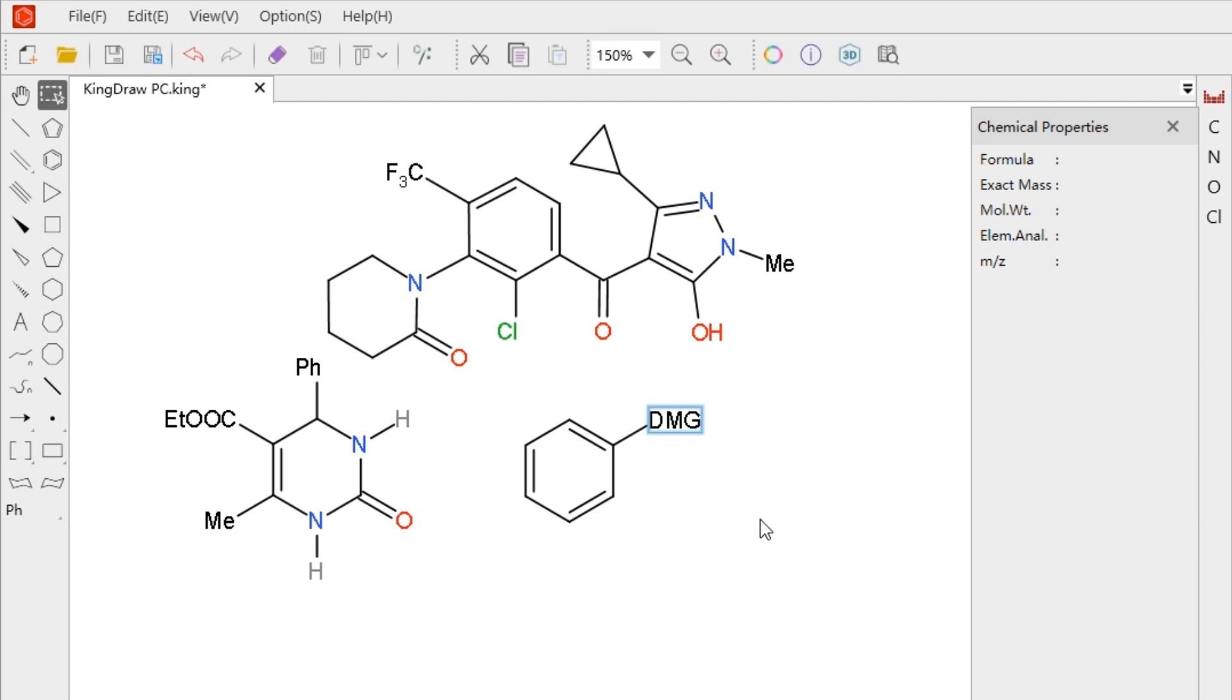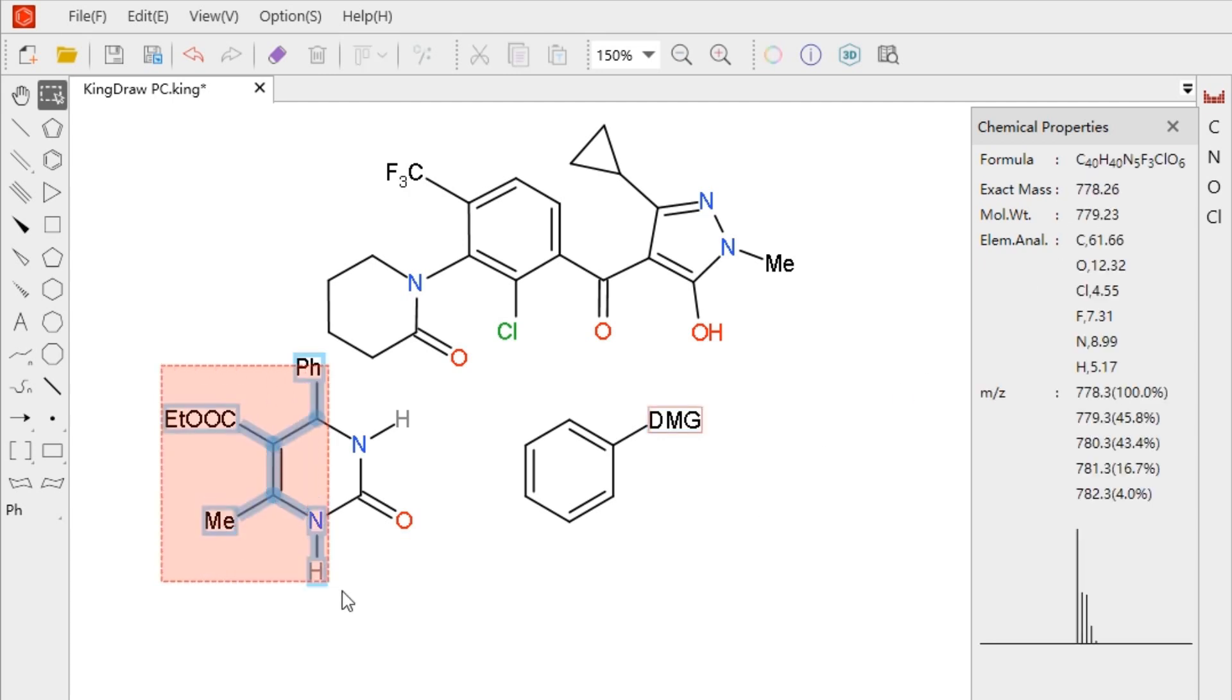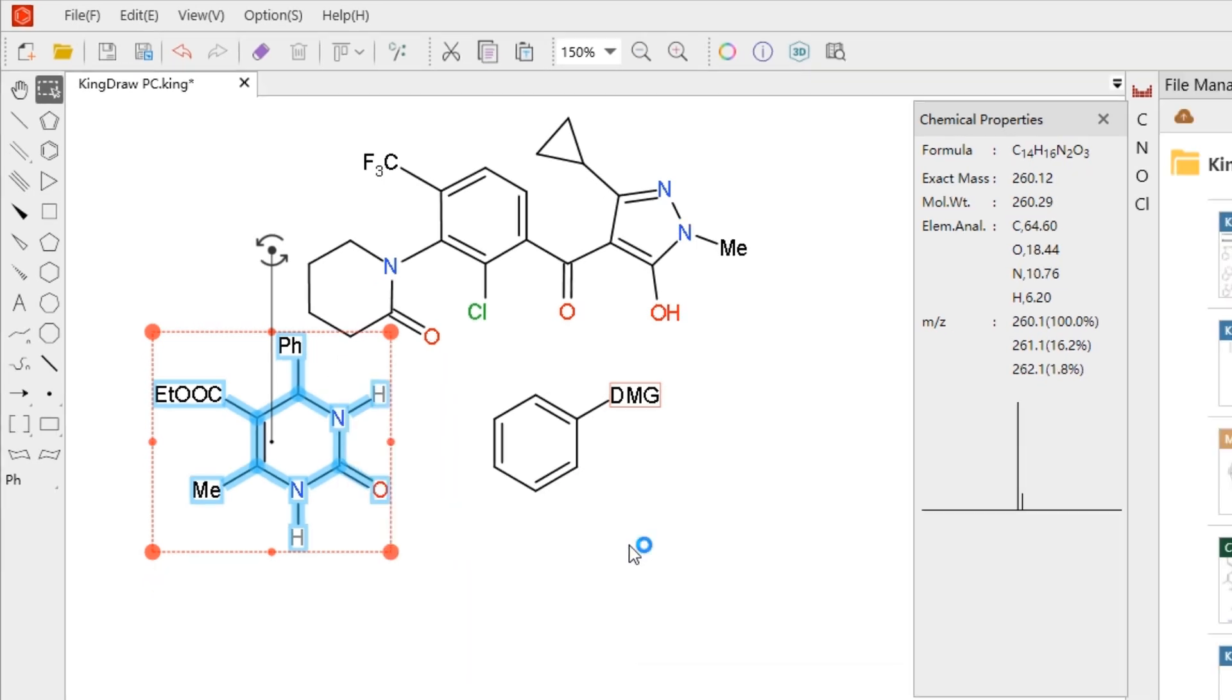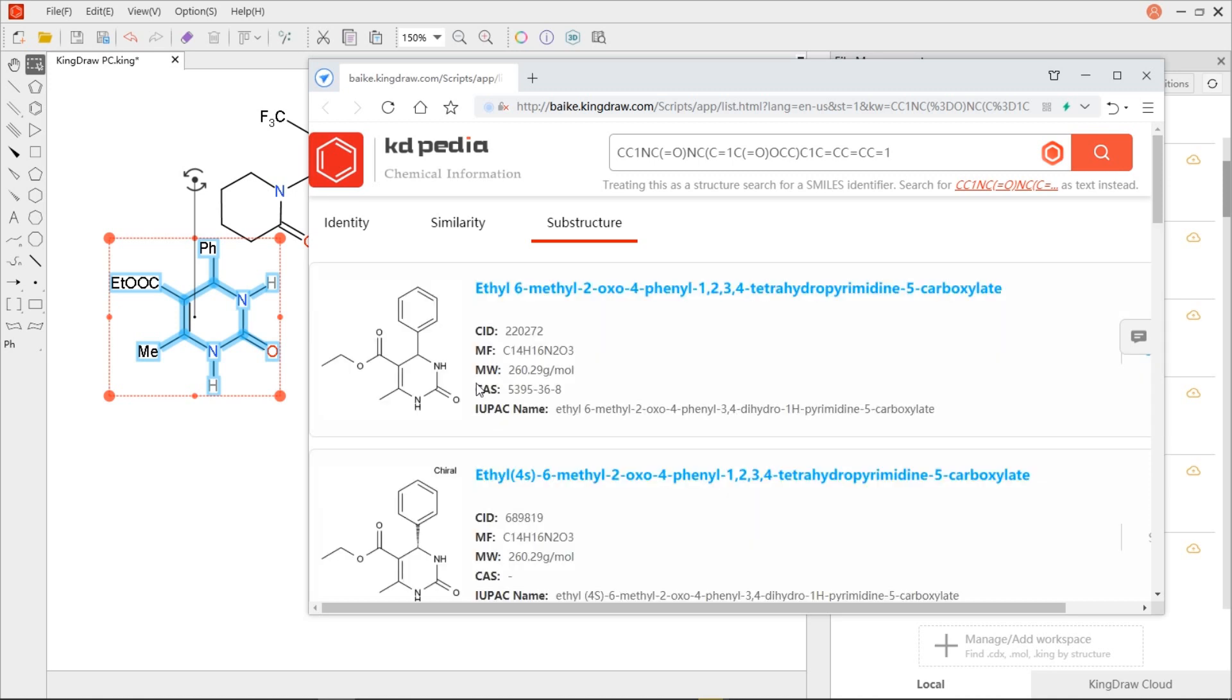If you want to know more information, we can select our structure and click Search Structural Kindropedia in the right-click menu to query more detailed compound information.